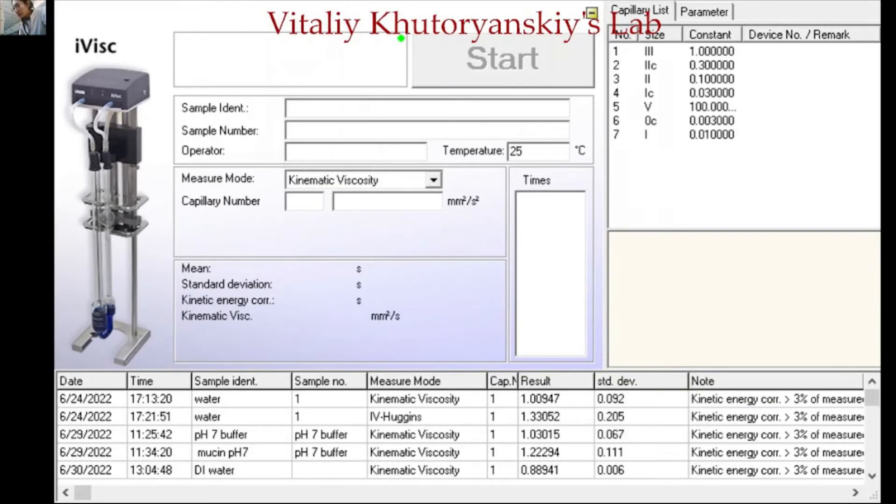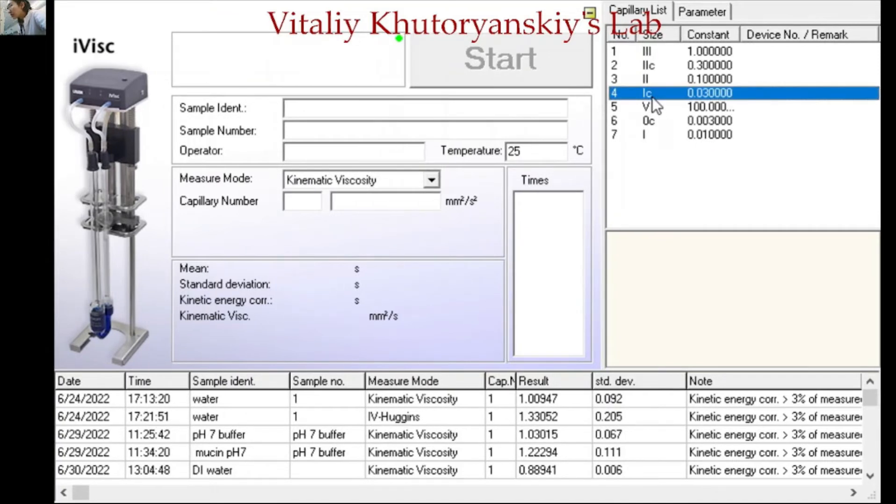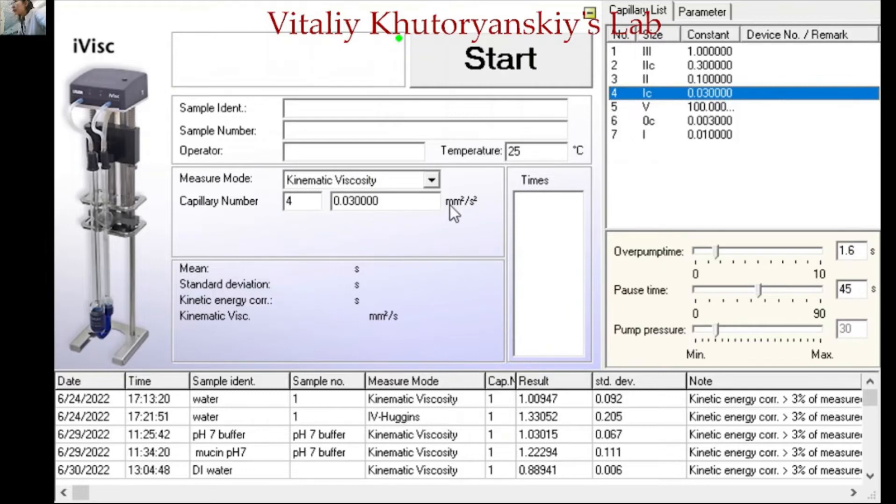Now we are going to open the software. The software is IVISC from Loda. First, we are going to measure the kinematic viscosity. From the right column, choose the capillary type we are using — currently the IC type, so click IC. Then choose the capillary number, which will appear automatically. Then choose the measurement mode; we are measuring the capillary viscosity.